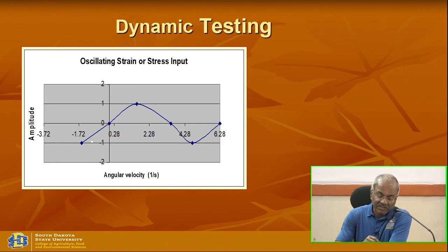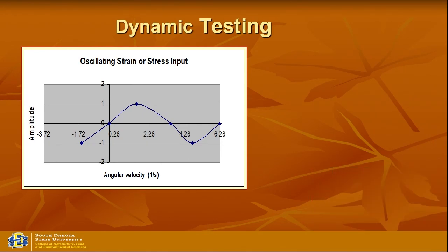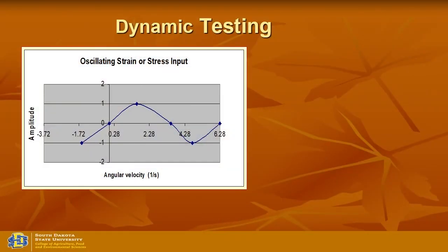In a similar way this can be viewed, this is oscillating. On the other hand, when you look at the surface of the material here, on top of that you apply the oscillating stress or strain, and that's what it is. So when you do oscillatory stress or strain, you apply the sinusoidal wave, and once you apply stress you get the strain. If you apply strain you get the stress output. Are there any questions on this one?